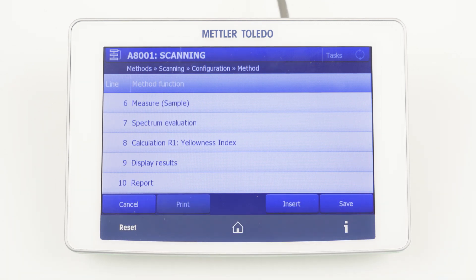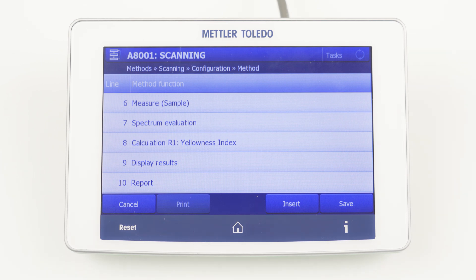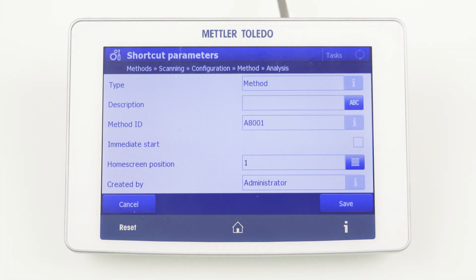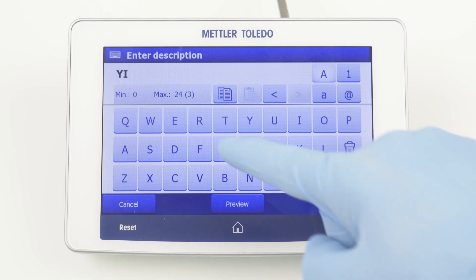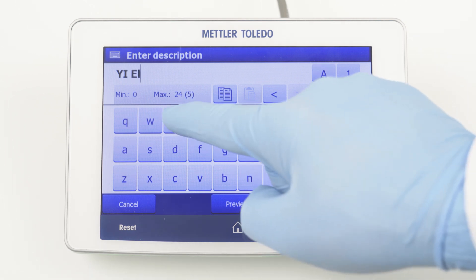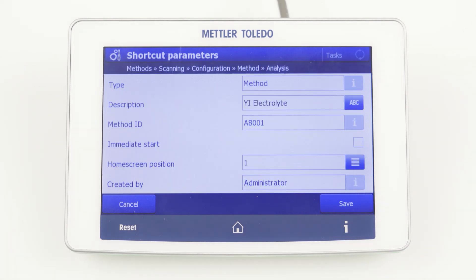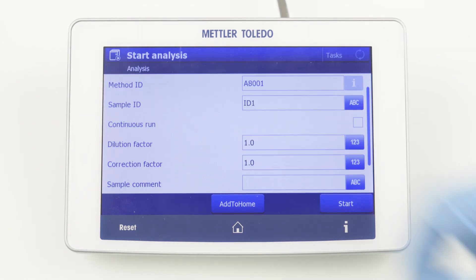Last, you can define how the results should be displayed on the screen. As we have only defined one result, we define one result field and select our yellowness index from the results list. Now we can save the method and are ready to start the method by clicking Start. You have the possibility to save the method to your home screen with Add to Home. This will create a shortcut on the home screen and is highly recommended for frequently used methods, as they can be started with one click. For this, you have to define the name, for example, YI Electrolyte. By saving it, you will end up on the home screen.